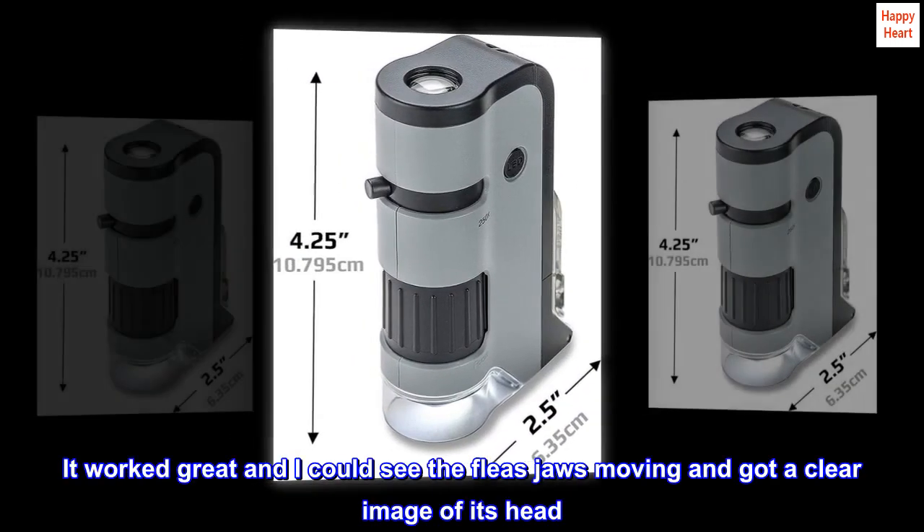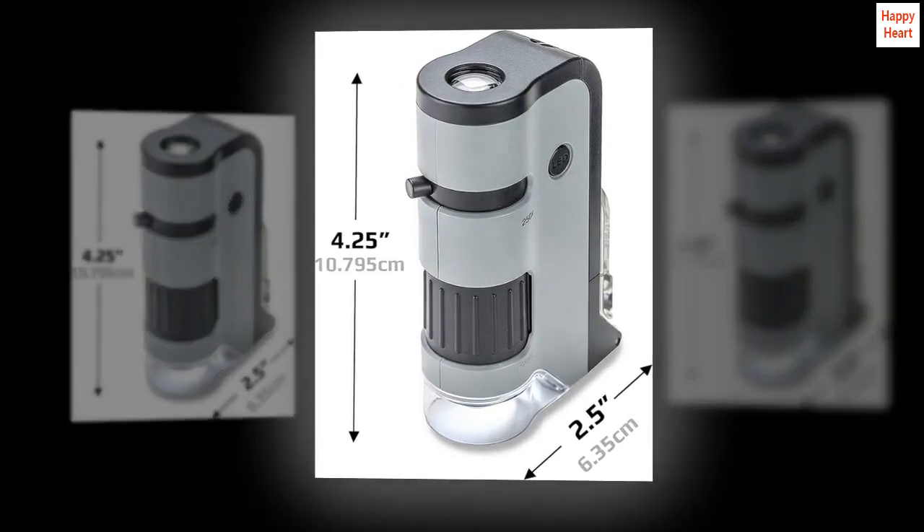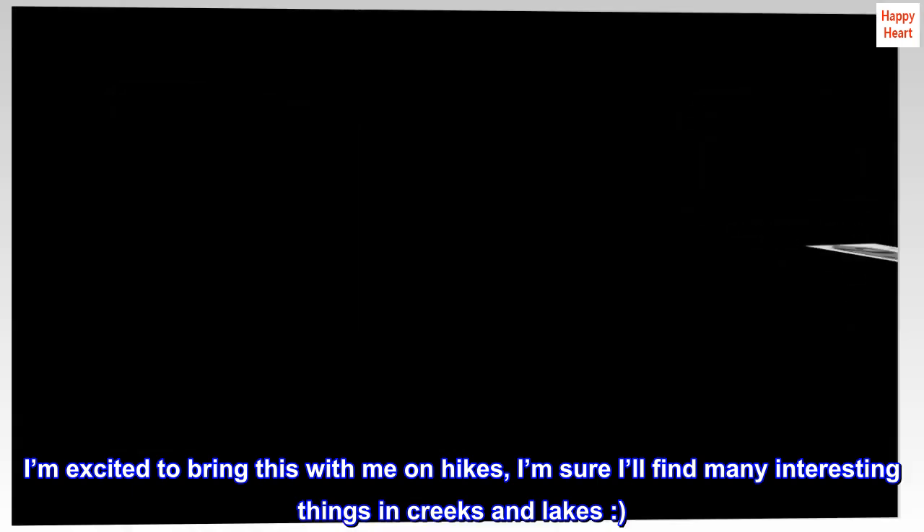It worked great, and I could see the fleas' jaws moving and got a clear image of its head. I'm excited to bring this with me on hikes — I'm sure I'll find many interesting things in creeks and lakes!